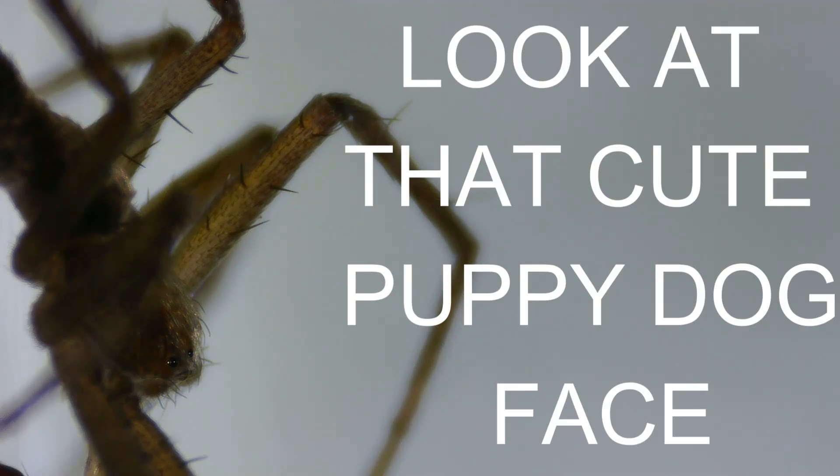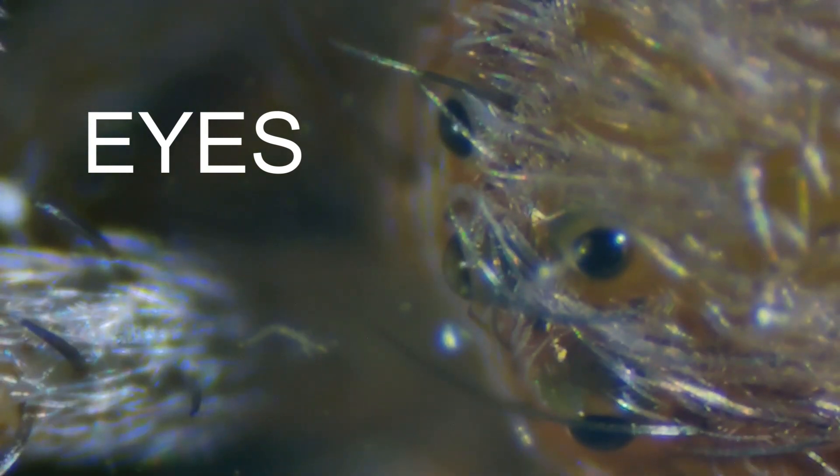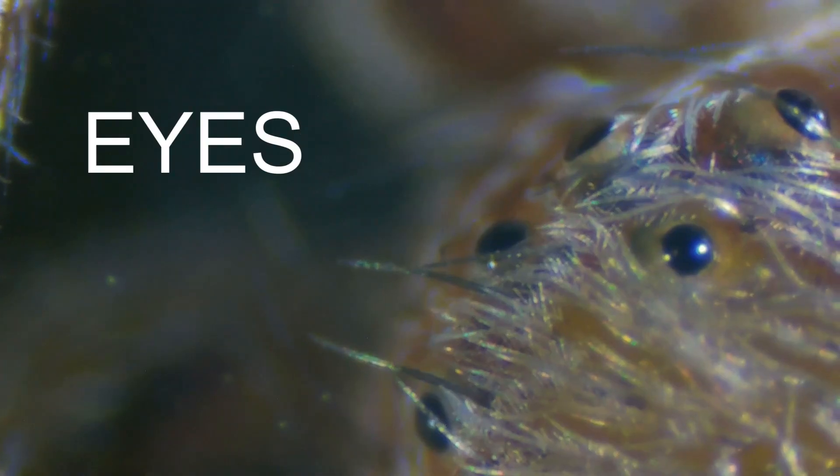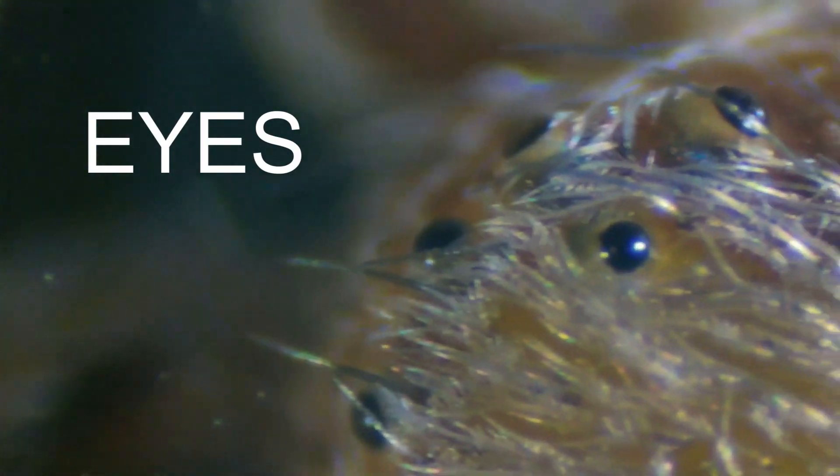Those eight delicate legs, covered in fine sensory hairs, are the spider's primary tools. These hairs, known as setae, are extremely sensitive to the faintest of air currents.